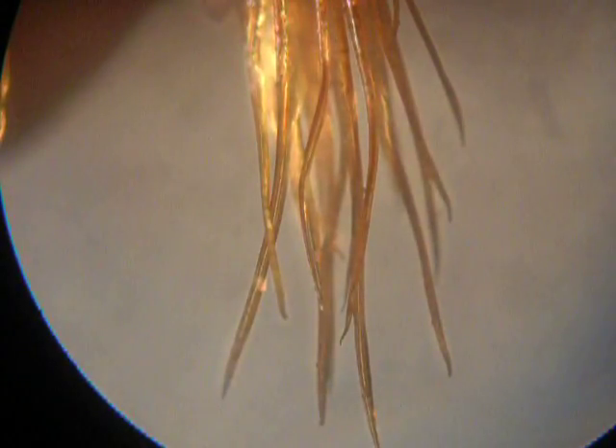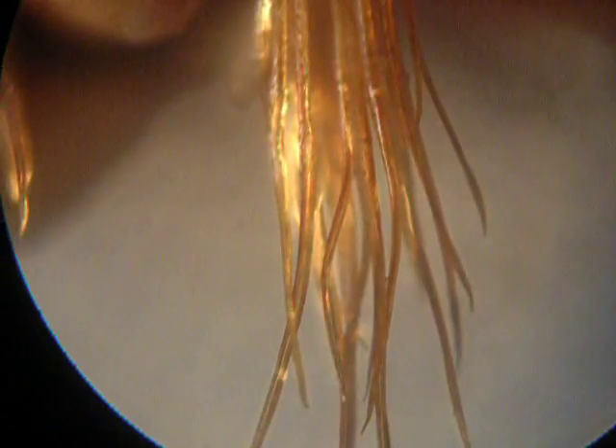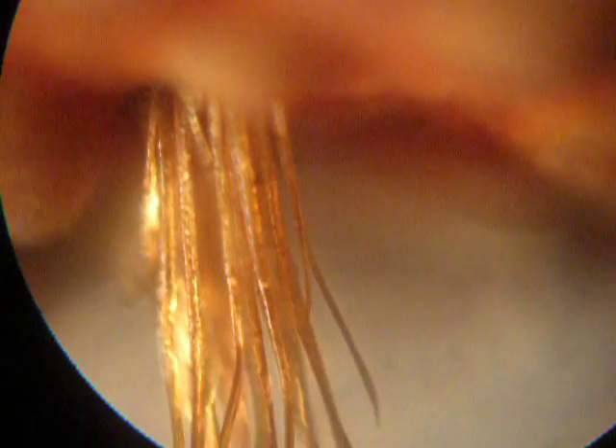This is the mechanoreceptor, close up. We'll go down — this is how it penetrates into the shell. There's other receptors sticking out, penetrations that come through.